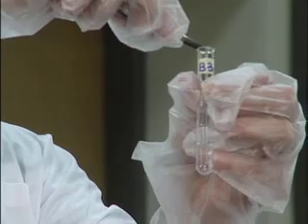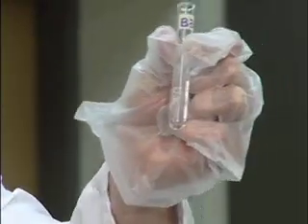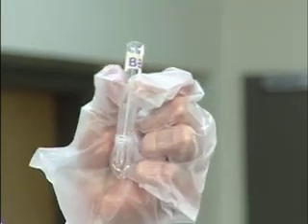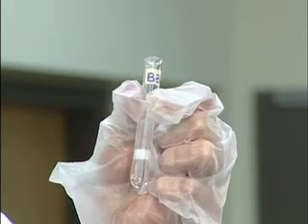When we put the magnesium into the hydrochloric acid, you hear a reaction, you see a gas forming. It's going nuts in there. You'll also notice, if you were able to touch it, a temperature change.